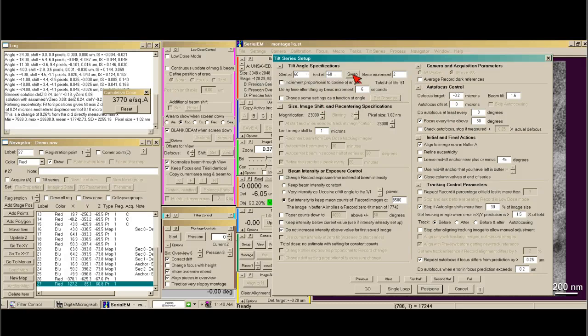I like to go 60 to minus 60 degrees, in this case with two degree increments. For beam intensity, I set it to keep mean counts of the record image at 8,500 for our camera — your camera may be different. I like to have my record set up at zero tilt to be pretty high compared to my target counts. This way I can check the box that says 'keep intensity below current value,' but it's very important that it's only used if you've already set up your intensity. The idea is to make the beam as small as possible that you're comfortable with, and it'll never get smaller than that — so you have no chance of the beam edge getting into the image.